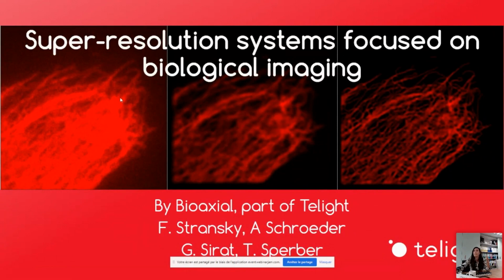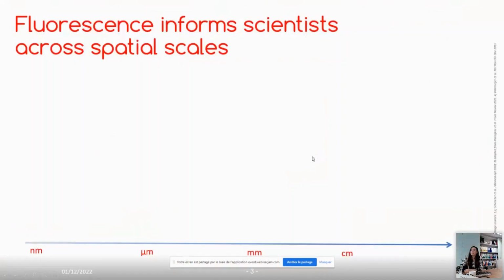So this is an example image comparing a wide field microscope, where our illumination goes across the entire plane, on a structure called vimentin. Here is the same region where we do a confocal scan. We clean up a lot of these fibers and structures, but we still have quite a bit of blurriness. Hopefully what you can tell on your screen, maybe better than a projector, is that there's a fine mesh of these structures here that we're able to actually resolve through super resolution technologies.